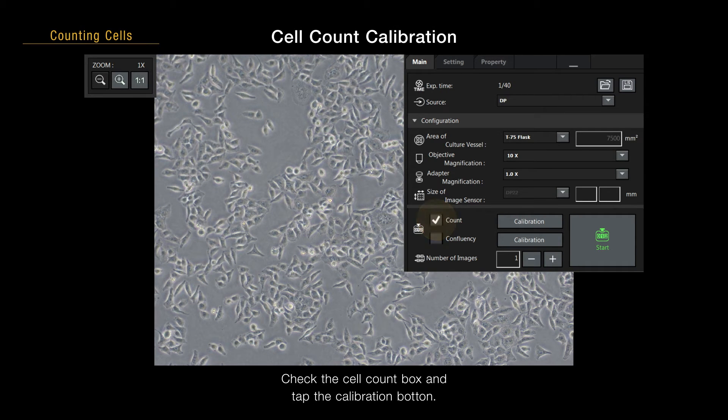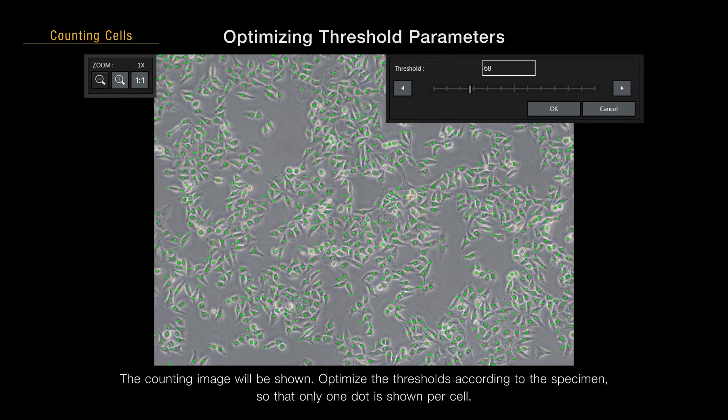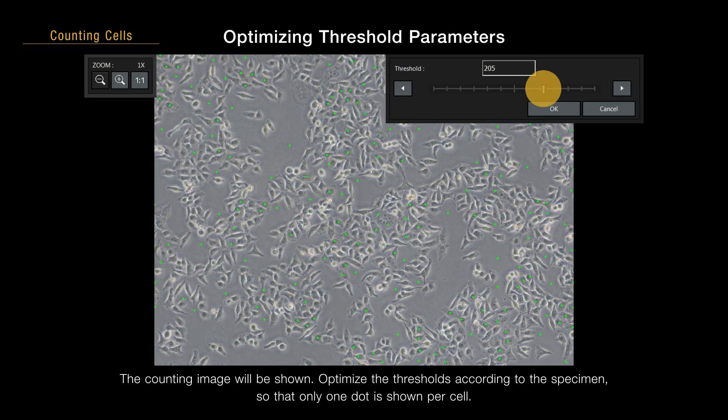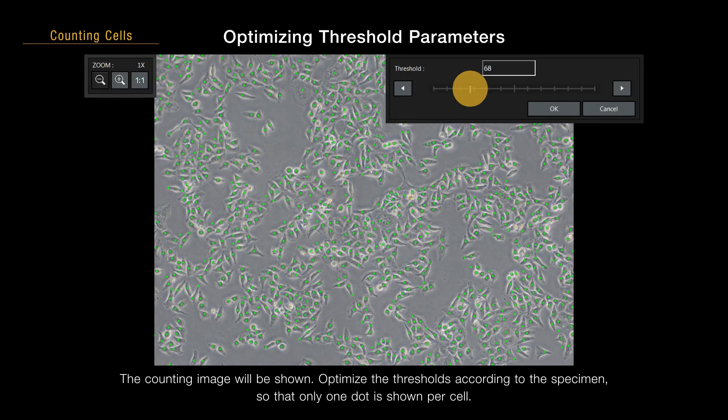Check the cell count box and tap the calibration button. The counting image will be shown. Optimize the thresholds according to the specimen so that only one dot is shown per cell.